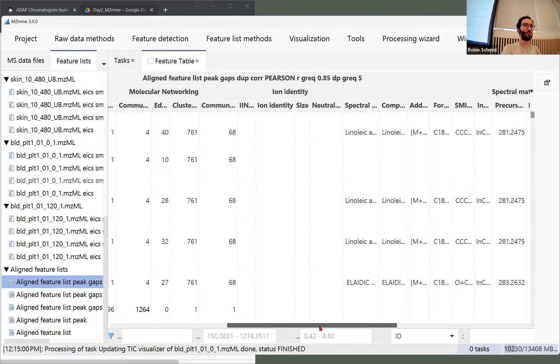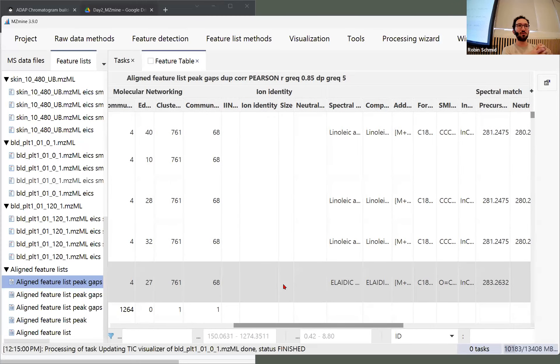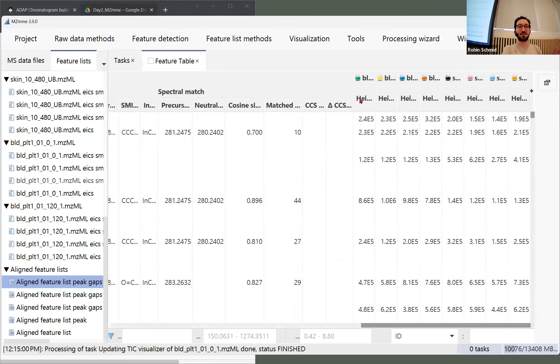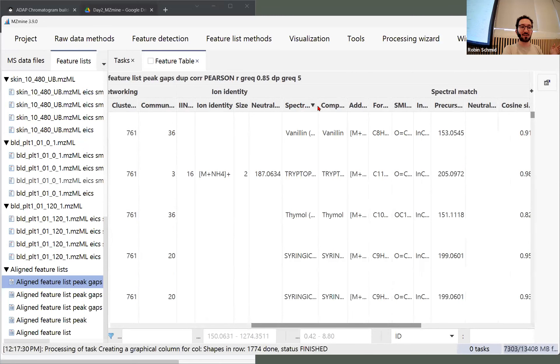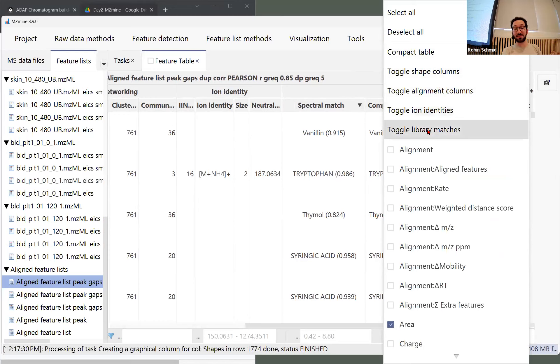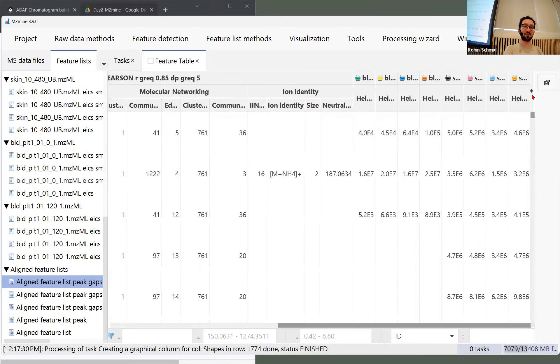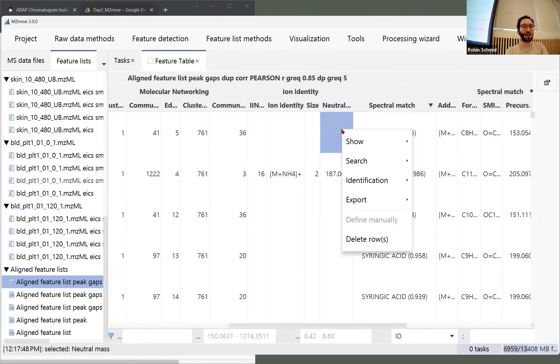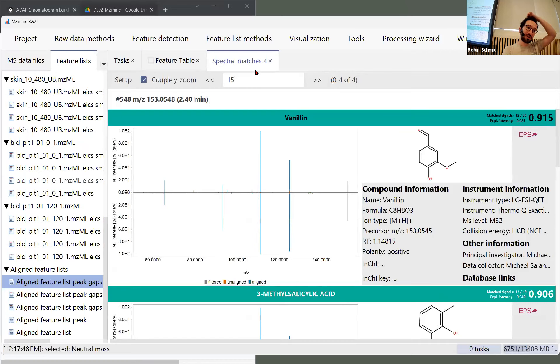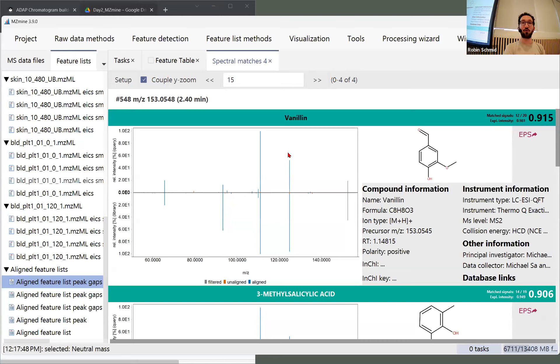That's because there's spectral library matching that we already applied and molecular networking that we're going to look at — there will be a whole session tomorrow, but it's a very central topic so we're going to introduce it today already. On the right side you can see all the different intensities across samples. If I sort by spectral library match — and you can toggle library matches with the plus button — I can right-click and show the spectral library search results.